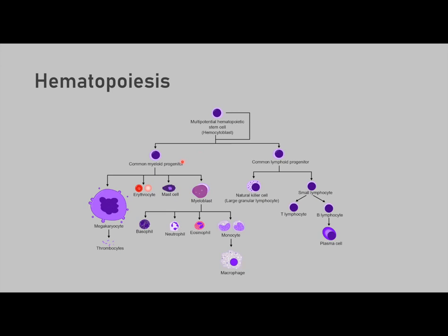And the main method that people have been using for that, and it's very popular right now, of course, is single cell RNA sequencing. But we were wondering if we could use what people call visual proteomics to see if we can map state of cells to fate. And visual proteomics is basically a fancy word for taking images of cells with cryo-EM and doing some sort of quantitative analysis that quantifies the abundance and locations of biomolecules in that cell.